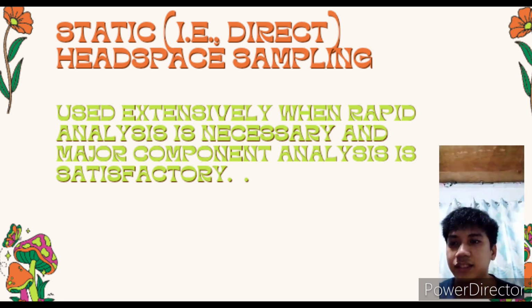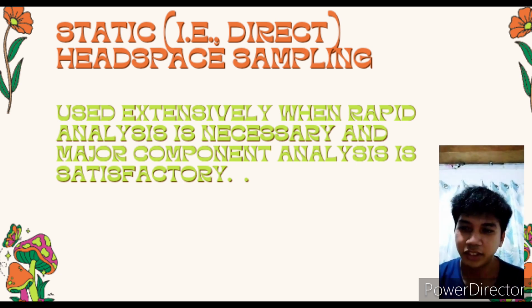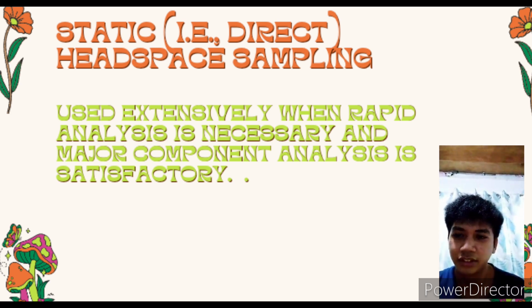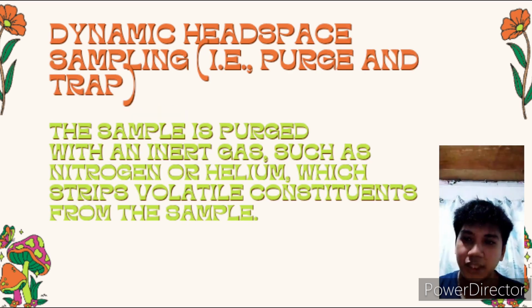So, ang static headspace sampling po ay typically used para ma-determine yung mga volatile at semi-volatile analytes sa liquid at sa solid matrices. Next po is dynamic headspace sampling.